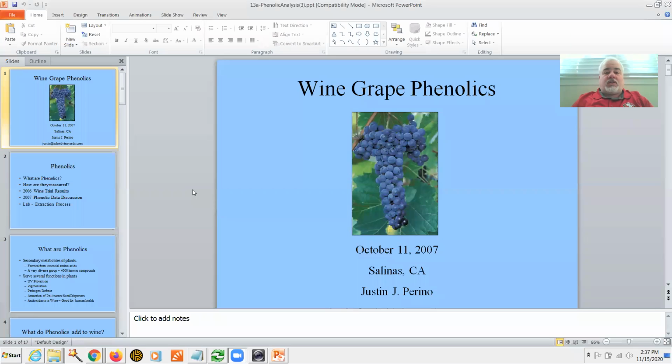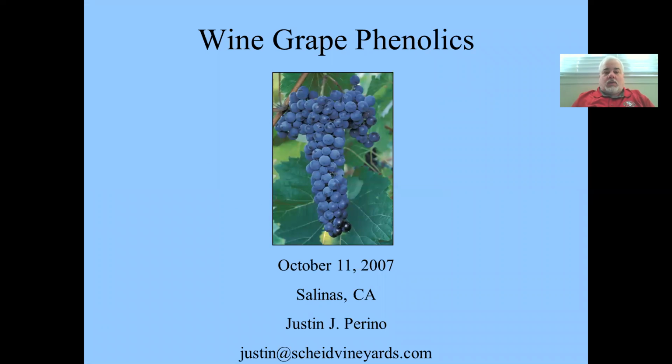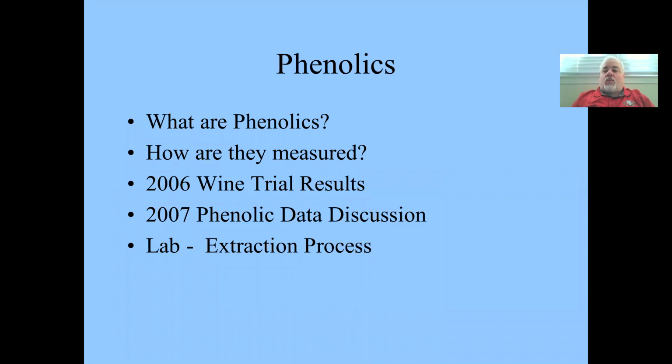Welcome back. This next presentation is about phenolics in wine grapes. So we'll talk about what phenolics are, how they're measured, and provide some actual information on some trials that were done back in 2006 and 7 with some data, and the actual lab extraction process.